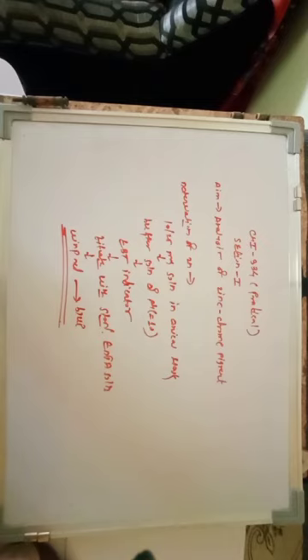The calculation is very simple. You have to take 3 readings. Similarly, you have to take 3 readings and find out the CBR, constant burette reading, which is used for calculation, and finally you find out the percentage of both zinc and chromium. So you should remember this process for determination of zinc and chromium.